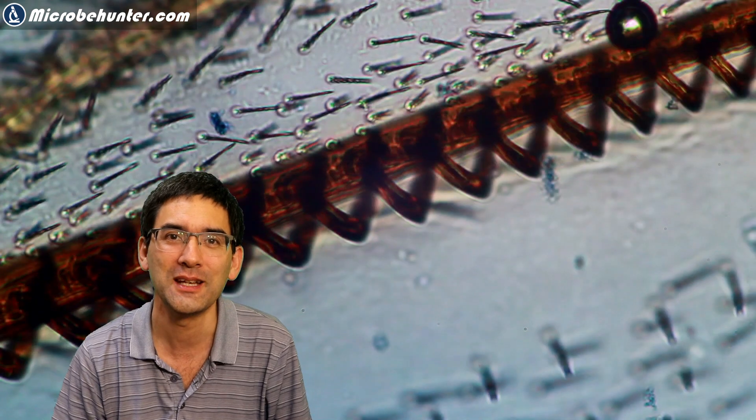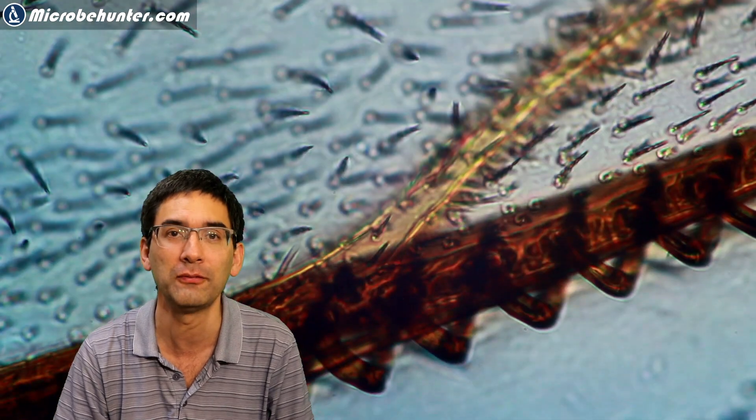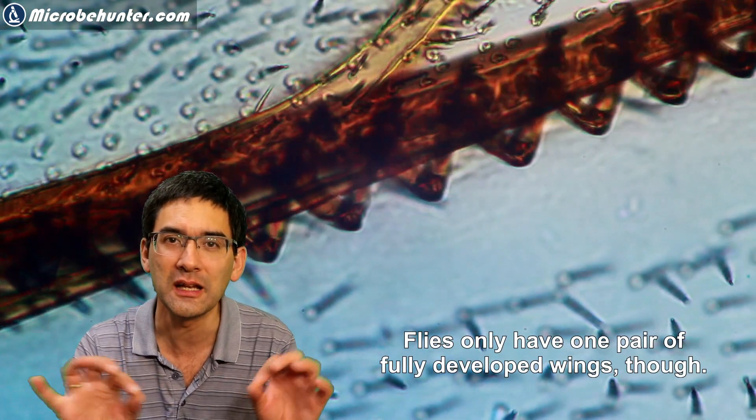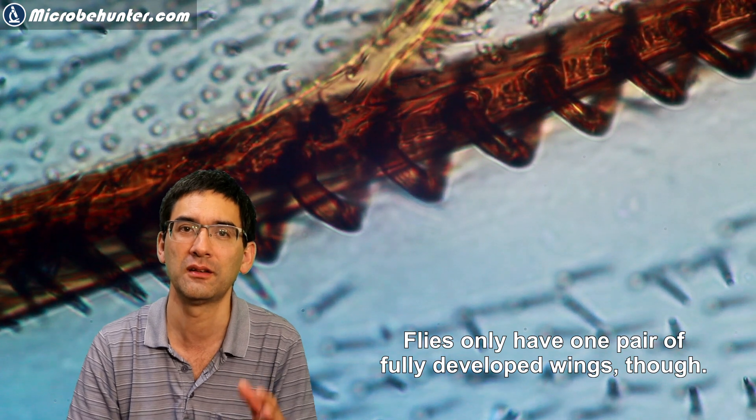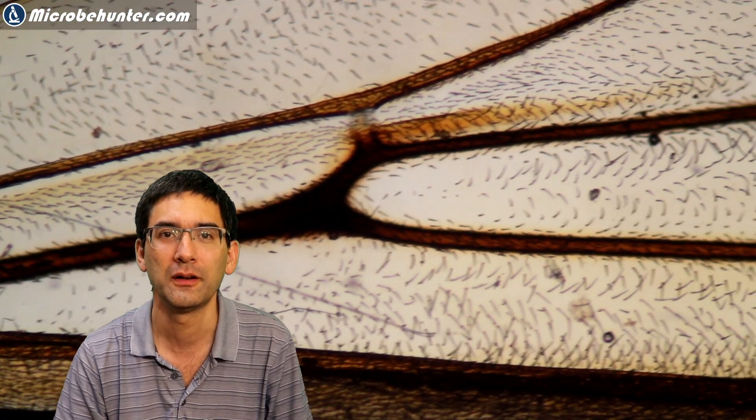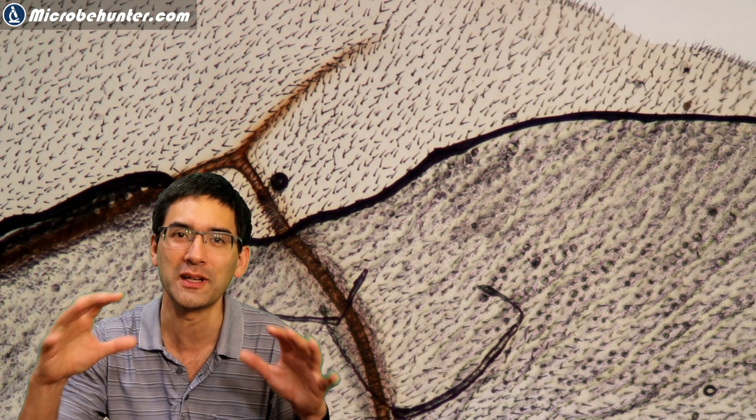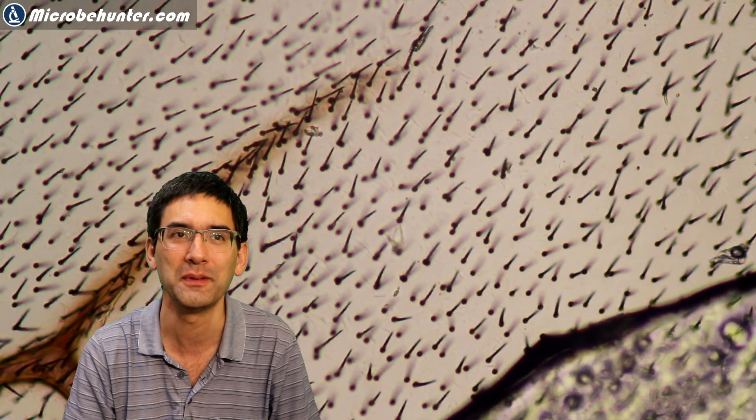I think quite fascinating to see that also the wings of other insects do also look similar. For example, flies, they also have those tiny little hairs on the surface and fly wings look therefore almost identical through the microscope here. Here we have, again, a big overview. You can actually distinguish different insect types and all the different species by simply looking at the pattern of the veins of the wing. So there are actually identification books where you have to look at the wing and then by the structure of the wing, you can actually identify which type of insect it is.